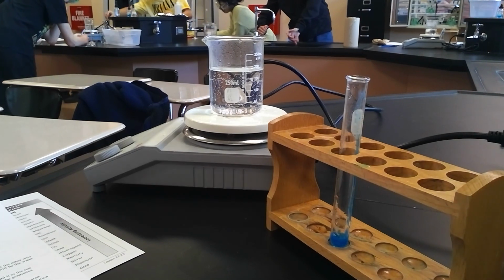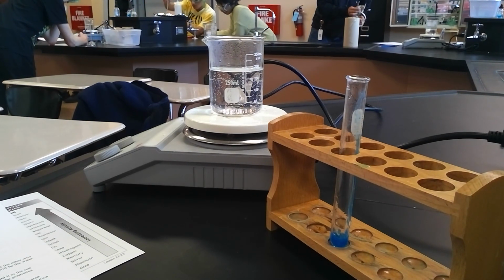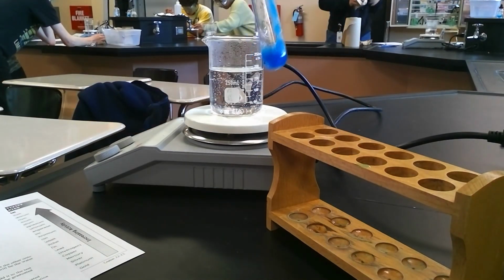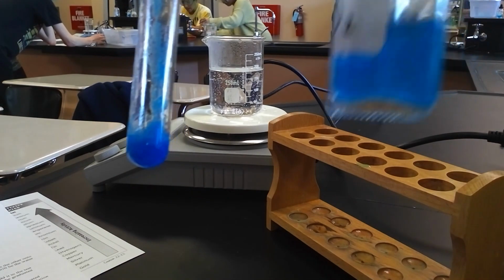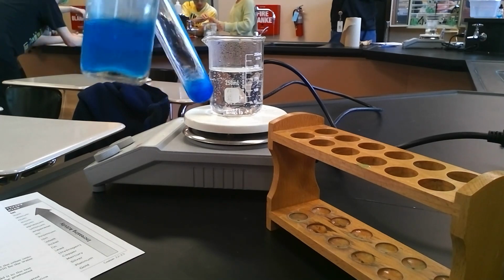And instantly you can see a color change here. It goes from kind of a lightish blue to a darker blue. So we have a dark blue color. It started as kind of a light blue, so it might not be as dramatic of a color change as some other things. It kind of looks like it might be the same thing. Definitely on camera it's not translating as that different. See if the white background helps.